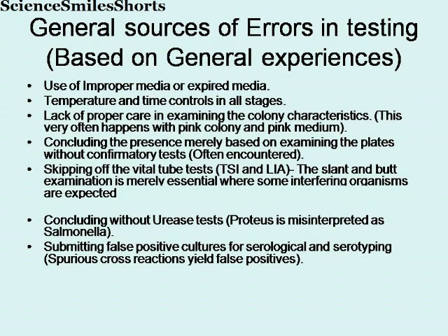I am presenting here the general sources of errors in testing Salmonella, based purely on our experiences. One is use of improper media or expired media. Number two, temperature and time controls in all stages. Number three, lack of proper care in examining the colony characteristics. This often happens with pink colonies and pink media backgrounds, and concluding their presence merely based on examining the plates without confirmatory tests. This is also often encountered. And skipping of the vital tube tests — TSI and LIA tests — is very essential to avoid.